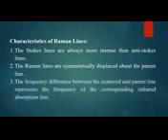The frequency difference between the scattered and parent line represents the frequency of the corresponding infrared absorption line. It is observed that the frequency difference between the scattered light and the parent, incident light is exactly equal to the frequency of the corresponding infrared absorption line, that is, the vibrational line.